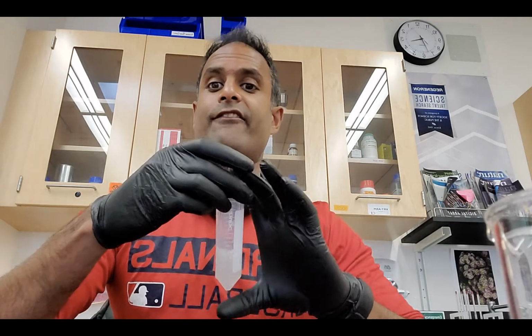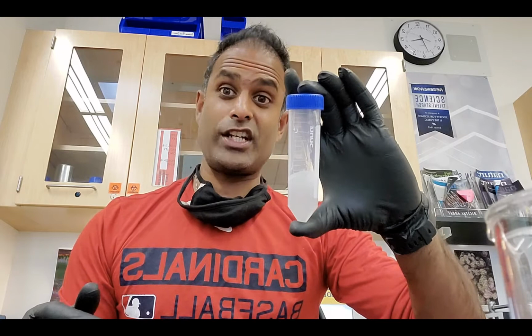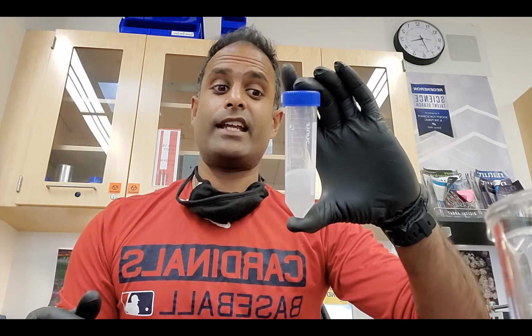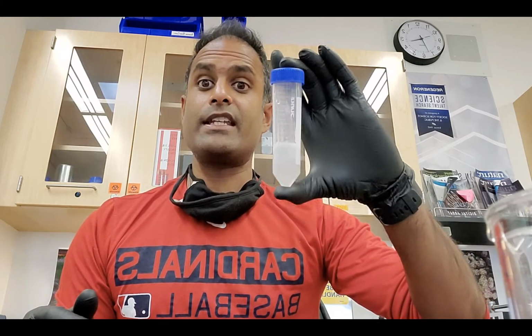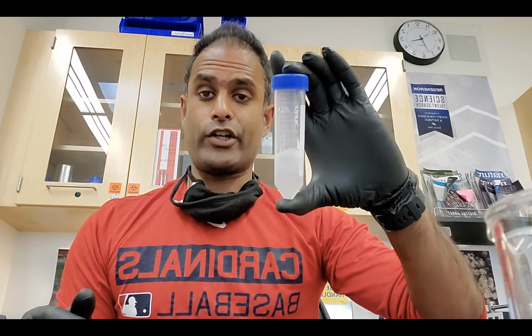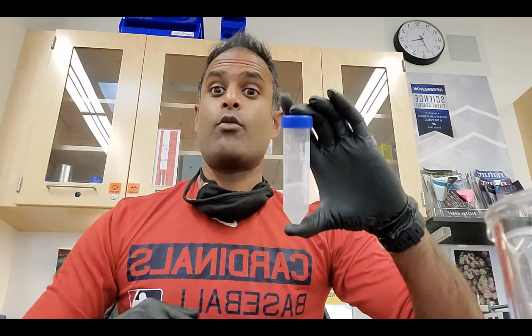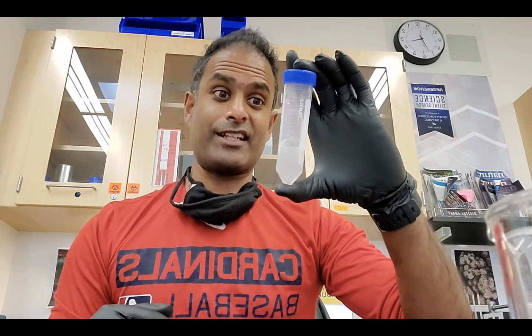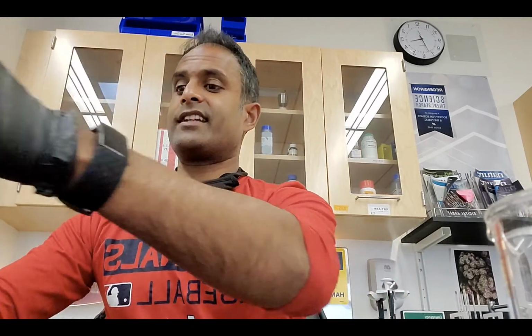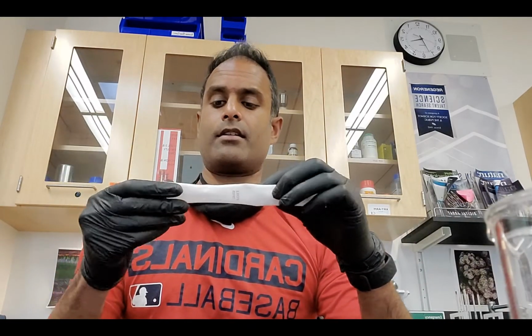Okay, this is a 50 mil Falcon tube. It now has a mixture of the cells that were in my cheek and water in it, and that is what we're going to get our DNA from. When you're doing this lab, it's going to be really, really important to know where your DNA is. It was in my mouth. It is now in this tube. One of the major mistakes made is that people accidentally throw away their DNA. I've done this several times. Okay. So I'm going to stick this to the side, and then I am going to go ahead and take a disposable pipette.